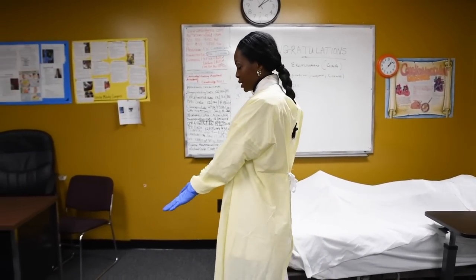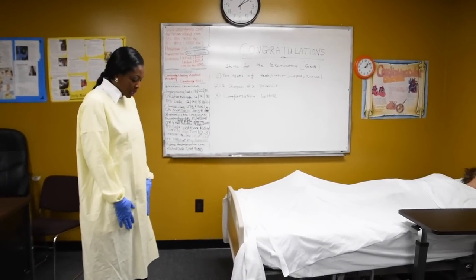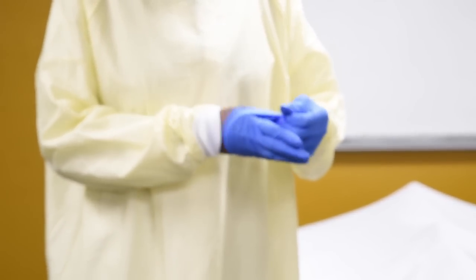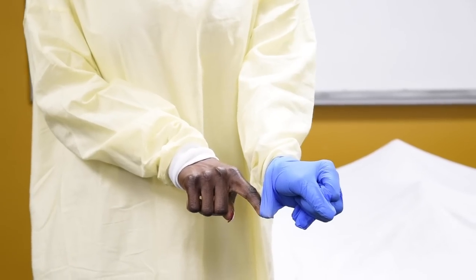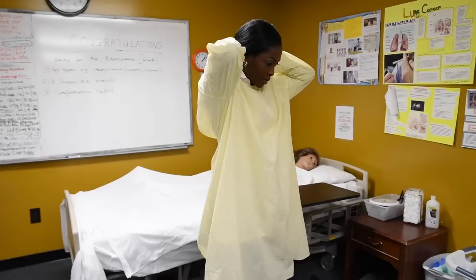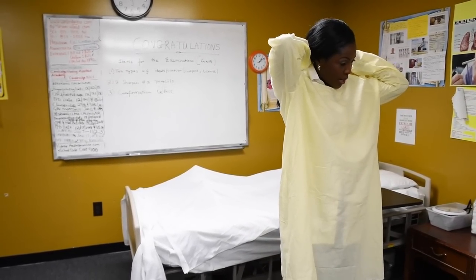Now that she sees I've done this correctly, turning around for her or him to see it, the next thing is that it says for you to remove it, okay? So again, you've seen me taking gloves off the whole day, right? There is a technique. The inside of a glove is considered clean. Okay, so that's how you take it off. Then you take the neck off. Hopefully, this will be easy the way I wanted it.